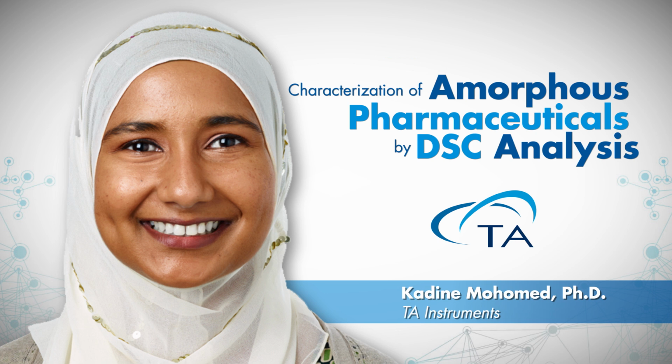Thank you. All TA DSCs are already designed to have the capacity to modulate the furnace, if you have a Q20, Q2000, or Discovery. Okay, great.